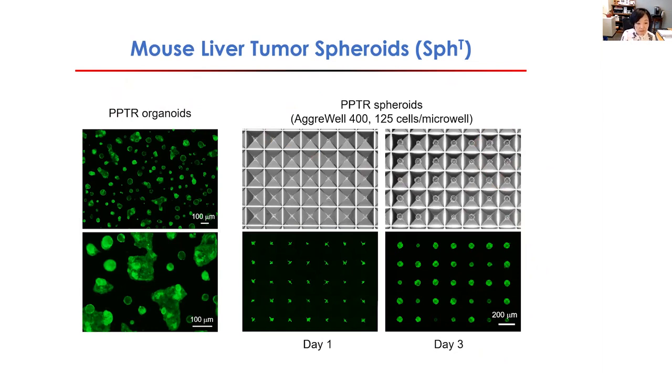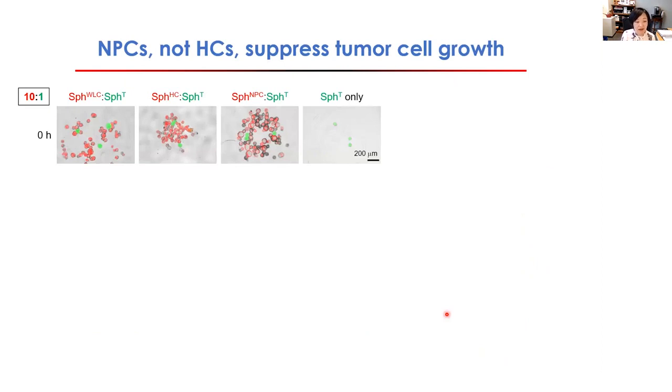So what we did is mix these green tumor spheroids with our red liver spheroids. We tried a 10-to-1 mixing ratio, so 10 normal, 1 tumor. Because we know that tumor cells grow way better than normal cells, we don't want them to overgrow quickly or shadow over the normal cells, so that we're not able to visualize their interaction that well. This 10-to-1 ratio that we tested actually worked pretty well.